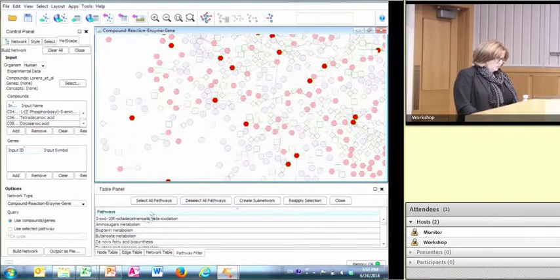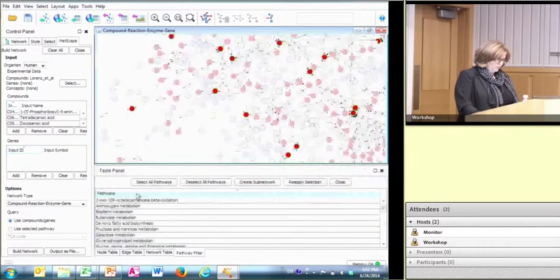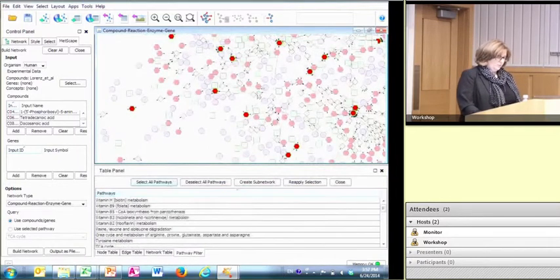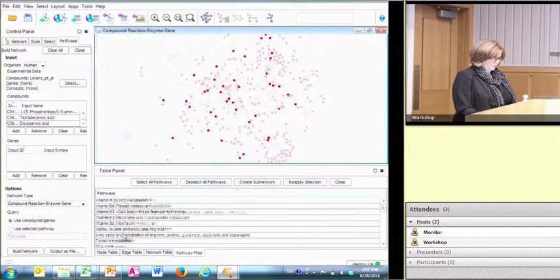As we discussed before, I have my pathway filter here. That's this tab here, and I'm just going to point out one more thing. I think they may be already sorted alphabetically, but if they're not, or if you wish to resort them, you can always do that. In this case, it's pretty complicated, but with this glucose exposure, you probably would want to look at something like the TCA cycle, right?